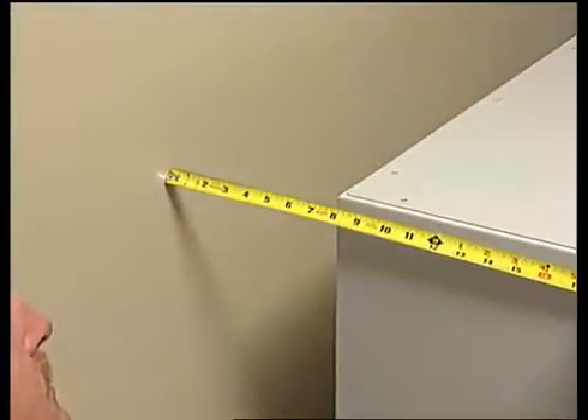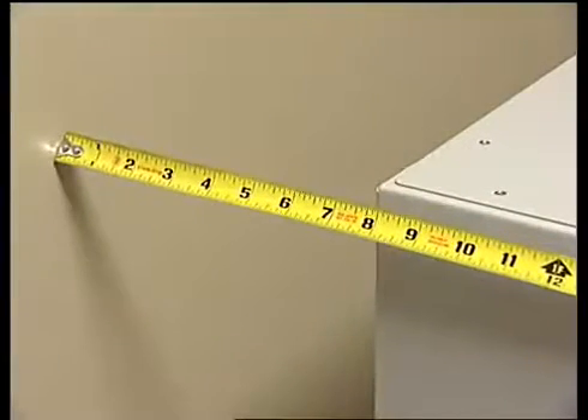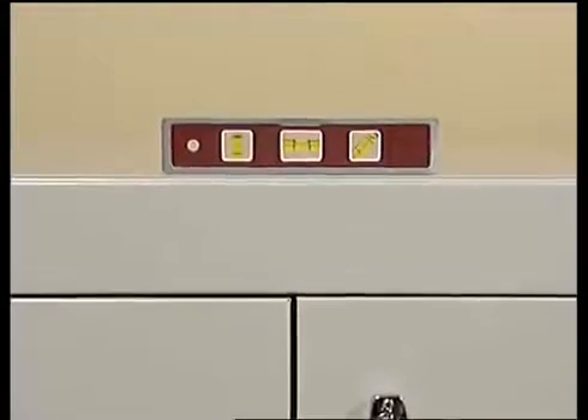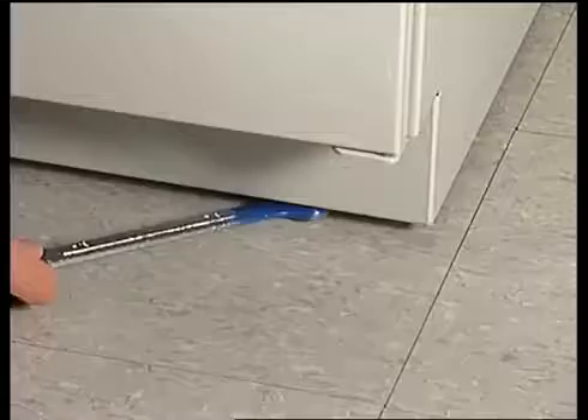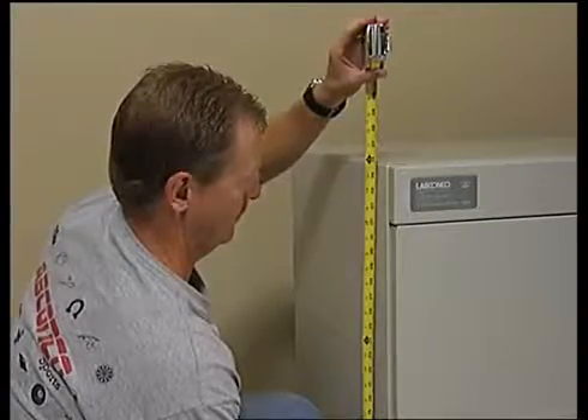Place the base cabinet in the approximate location near the ductwork connection and 8 inches from the wall to allow for utility connections. Use a level to check the base cabinet at the front, sides, and back, adjusting the leveling feet as required with a crescent or open-faced wrench. Ensure the top of the cabinet is 35 and 3 fourths inches above the floor.